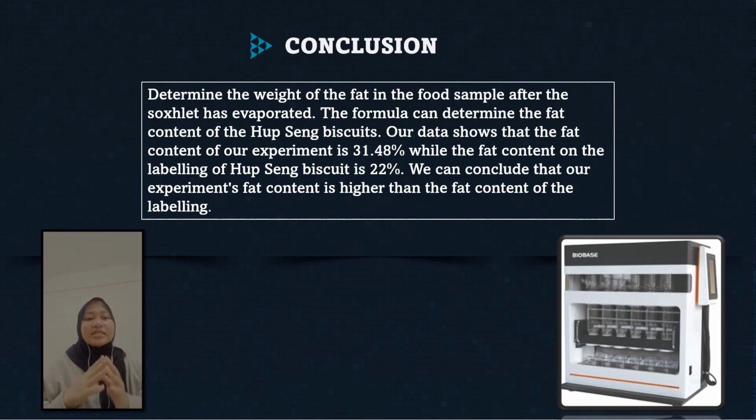The reasons are that testing and analyzing fat in food can be a complex process, measurements for nutritional components are said to be accurate to within 2% to 5%, and some of the fat is not indicated on the label. That's all from us. Thank you.